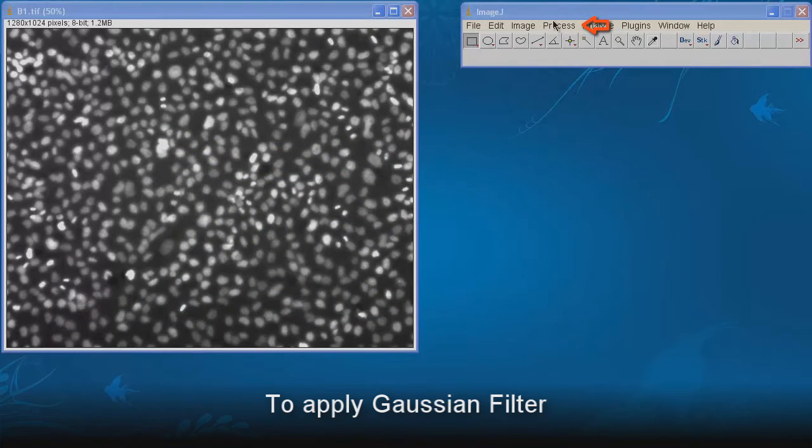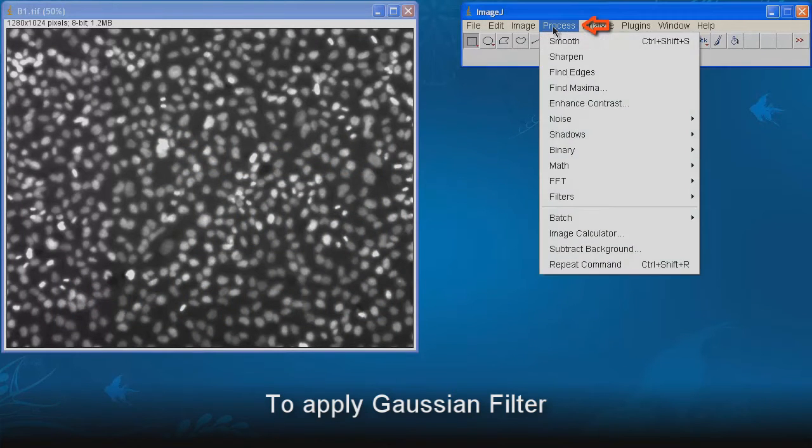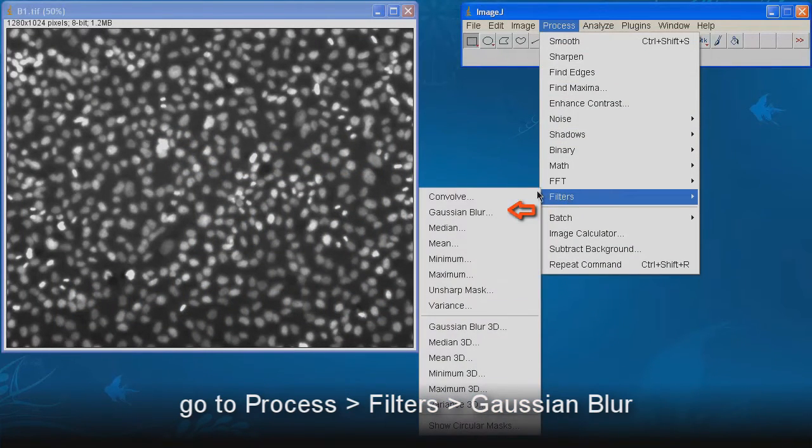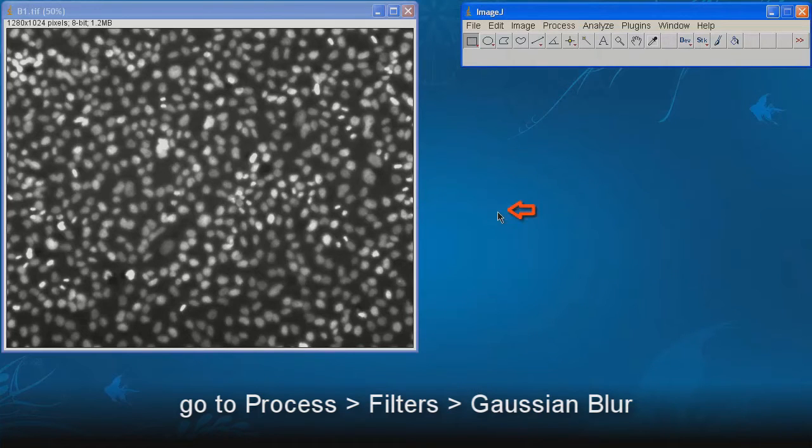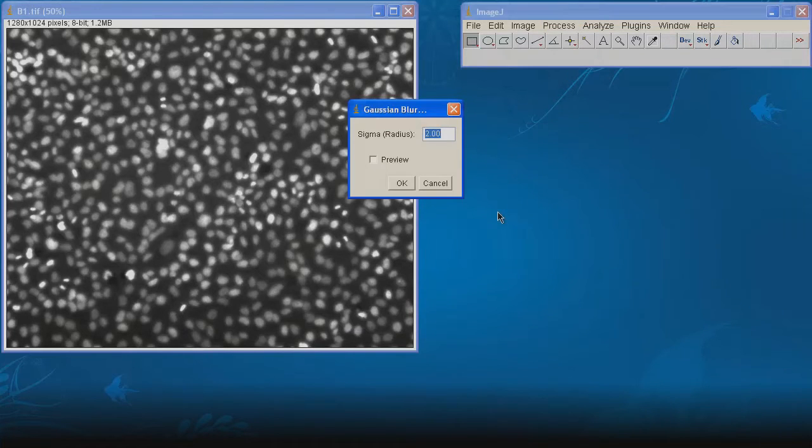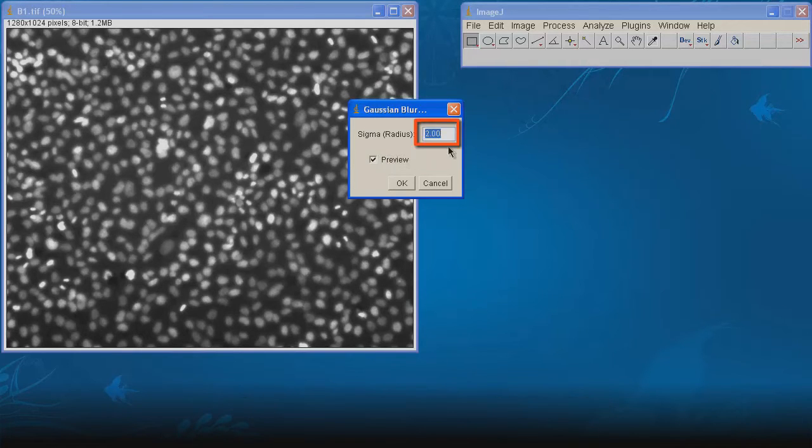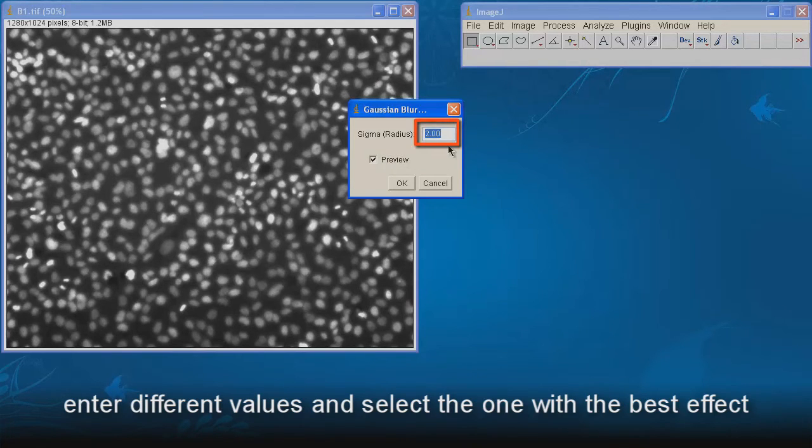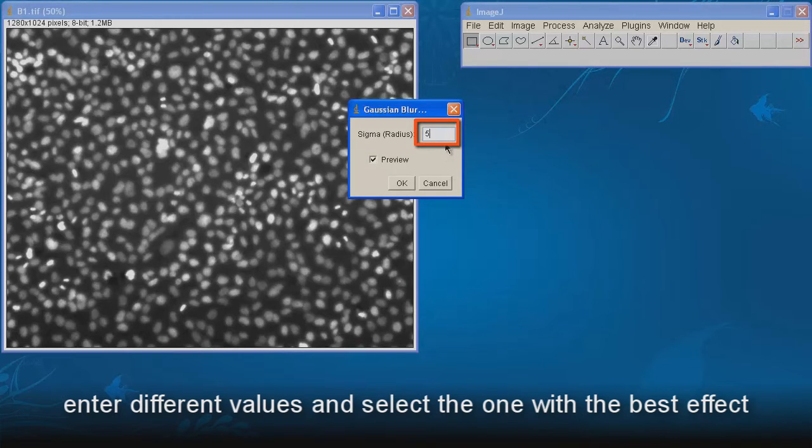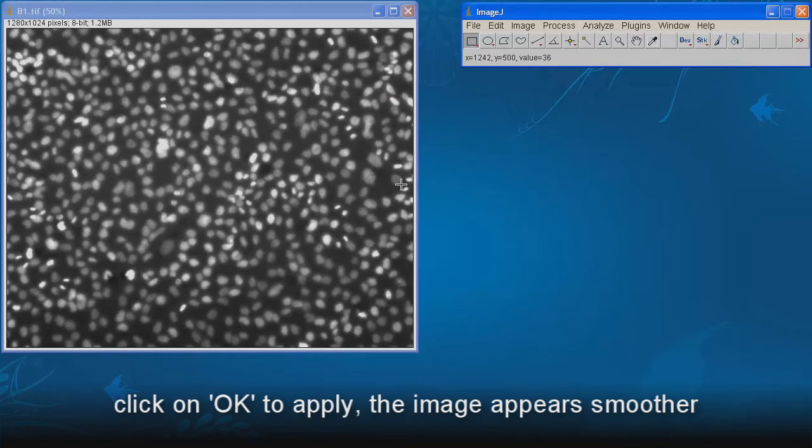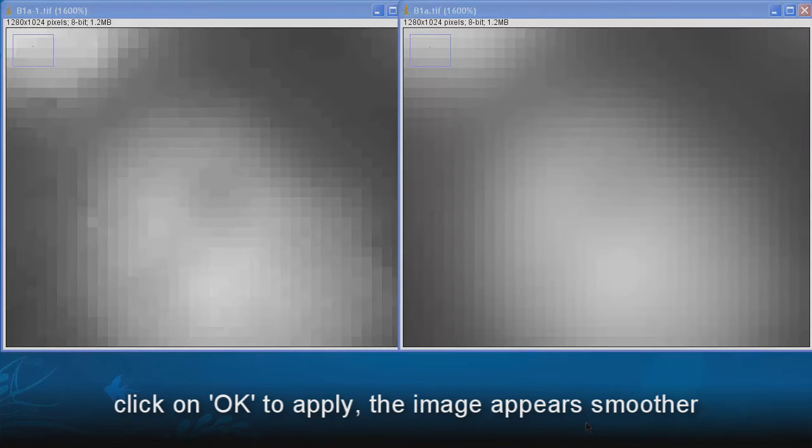To apply Gaussian filter, go to Process, Filters, Gaussian Blur. Tick on Preview to view the effect. Enter different values and select the one with the best effect. Click on OK to apply. The image appears smoother.